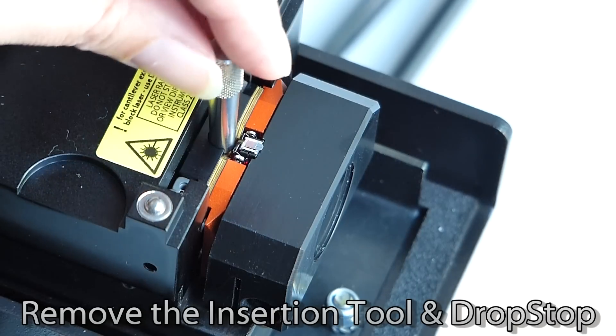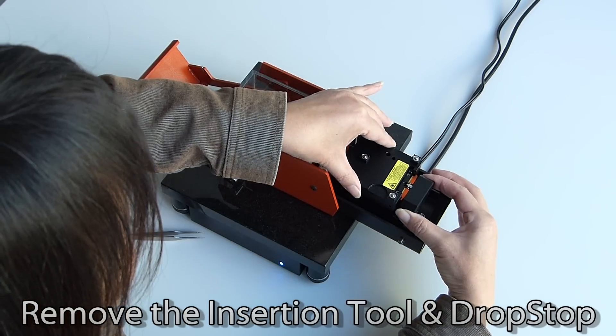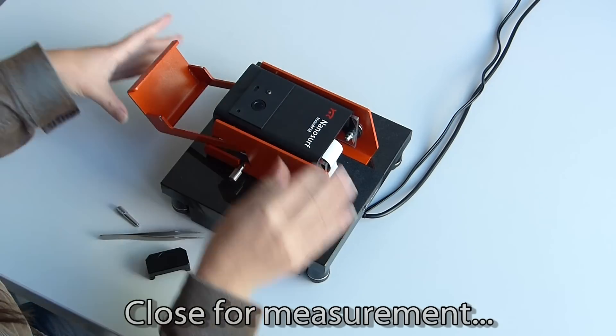Now you can remove the insertion tool and the drop stop. The scanner flips back into place easily, as does the locking cover. Now you are ready to start imaging.